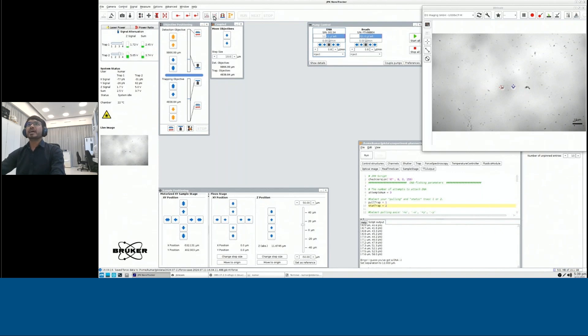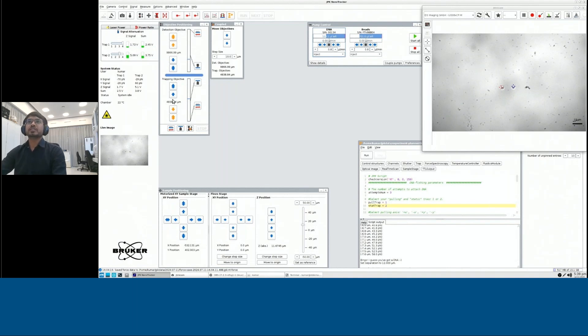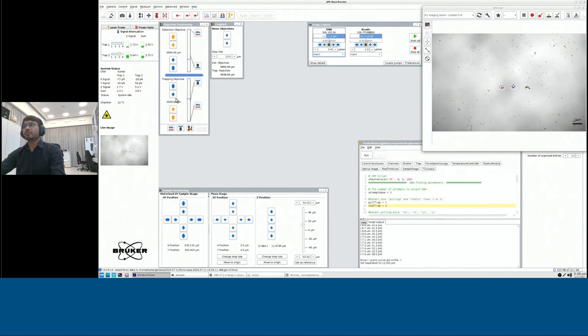Then we have a window where we could use detection objective or trapping objective to move and then go into the focus plane and trap some particles.